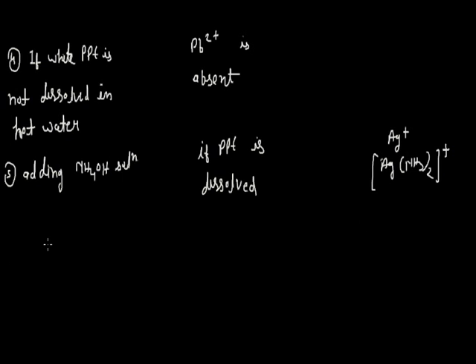Now the chemical reaction involved in that case is PPT of AgCl reacting with liquor ammonia, that is NH4OH, and after the reaction it gives the soluble complex [Ag(NH3)2]+.